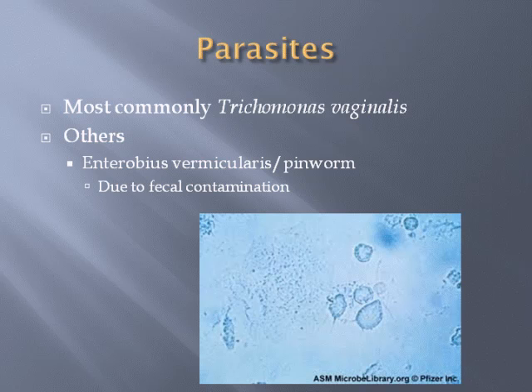And you'll be able to see the flagella, especially if you have the luxury to focus up and down. It's hard sometimes on a still photograph like this one. You can kind of see the flagella there, but truly not moving. You really can't say that they're present because they look an awful lot like white blood cells, or at least they can.